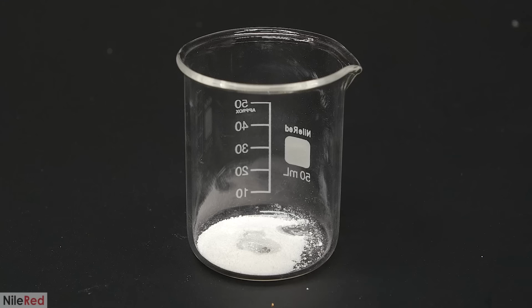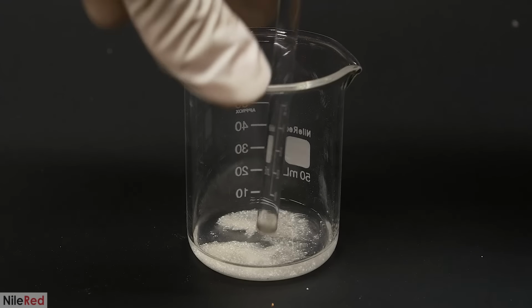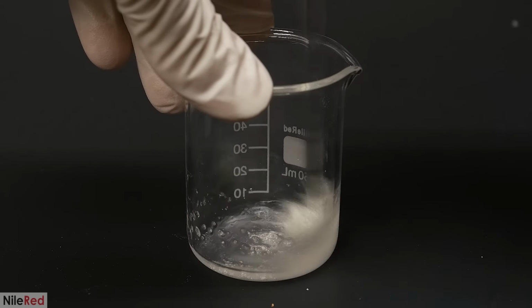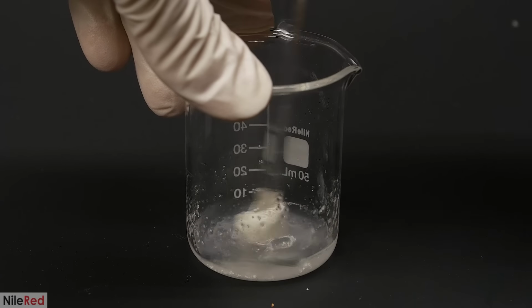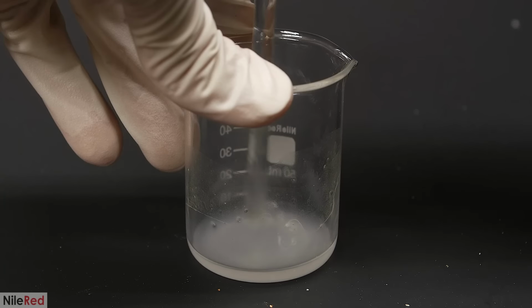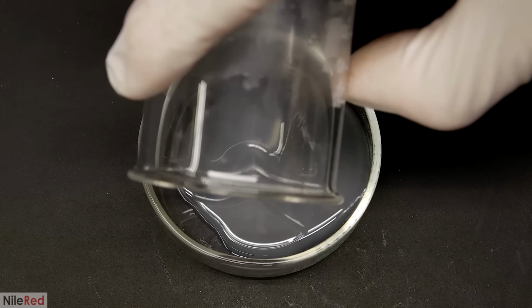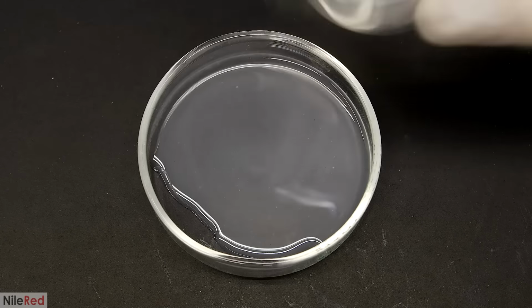The paper talked about a couple different plasticizer ratios that could be used, but I decided to go with 20%. I went with 20 because it seemed to offer a good combination of strength as well as flexibility. Anyway, just like before, it was all dissolved in a minimal amount of acetone and then poured into a glass dish.